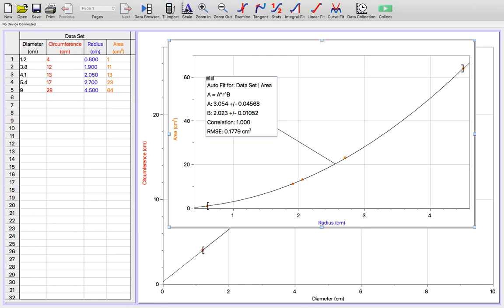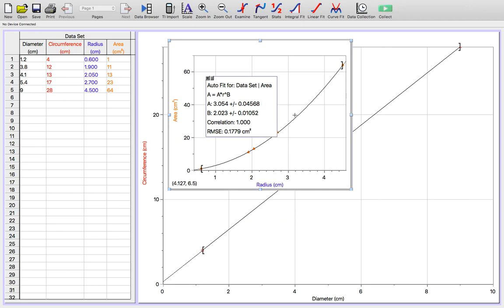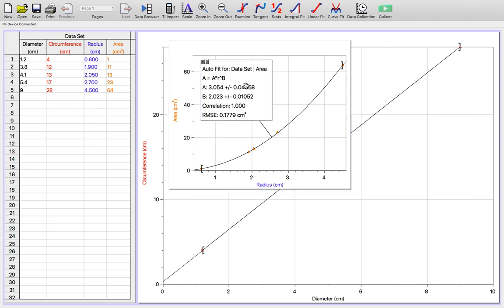If you're going to include your graph in a lab report, you should resize it so that the data is bigger in relation to the size of your graph. Simply drag one of the corners to make the graphic area smaller. I know that sounds unintuitive, but by making the graph smaller, you make all the text and data bigger in proportion to the graph size.